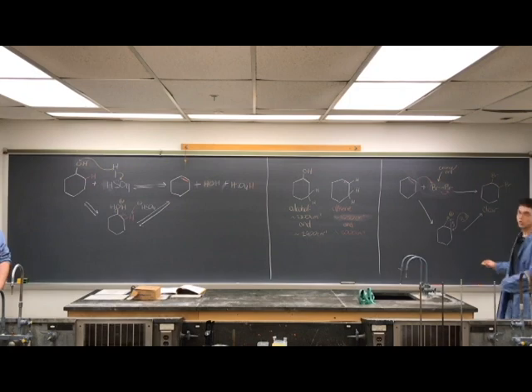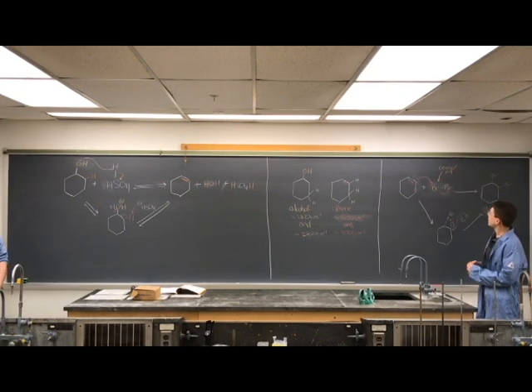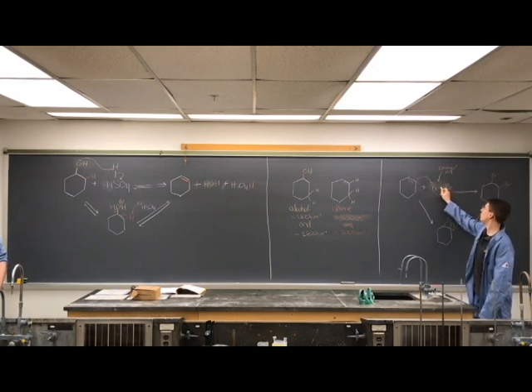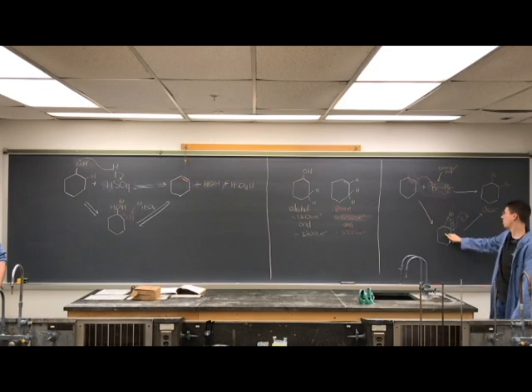The second way is going to be the bromine test. How this works is we take elemental bromine in solution, and the alkene acts as a nucleophile. Its electrons grab a bromine. The bond between the two bromine atoms breaks and moves to one bromine, and then you go down to this intermediate with a bromonium ion.